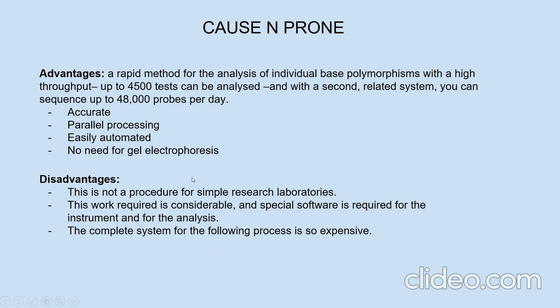These are some disadvantages. It is not a procedure for a simple research laboratory. Simple research laboratories cannot go through this process. This work requires special software for the instrument and for the analysis. And the third one is that the complete system for the process is so expensive. Pyrosequencing can sometimes be very expensive.